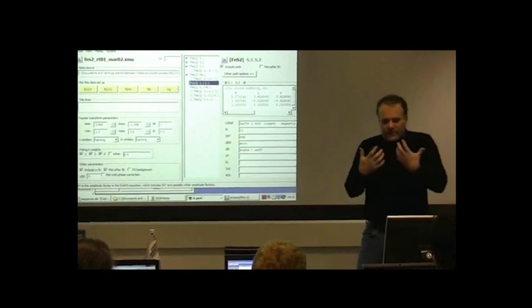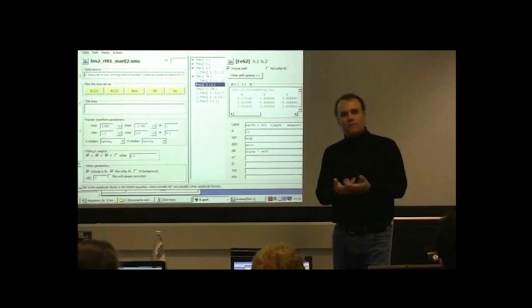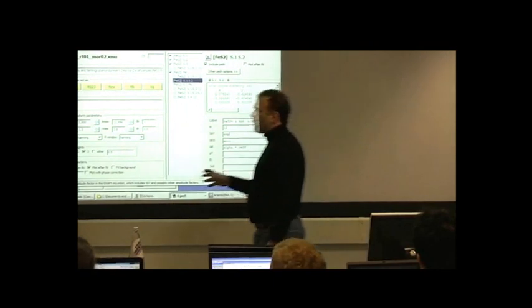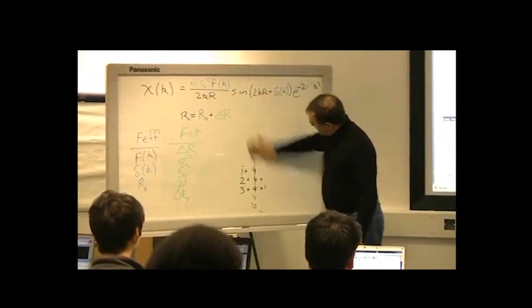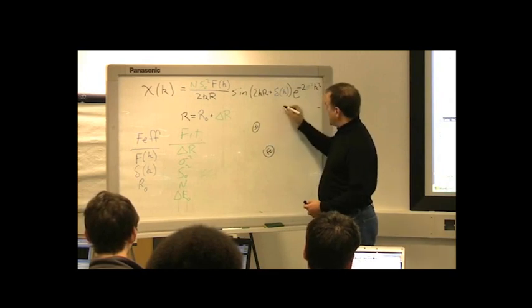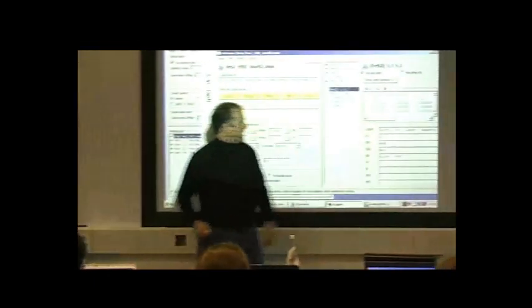It's concerning because we might be adding a parameter to the fit, but not adding a robust, well-determined parameter to the fit. But you kind of have this sense that we shouldn't even have to add any more parameters at all. And here's the reason why. So we're kind of done with this point, so I'm going to erase that. So we have the iron atom and the sulfur 1 atom, and somewhere else is the sulfur 2 atom. And I'm not really certain what kind of triangle they make. We'd have to go look at the coordinates. You could look at these numbers and figure out quite exactly how they're supposed to be laid out.